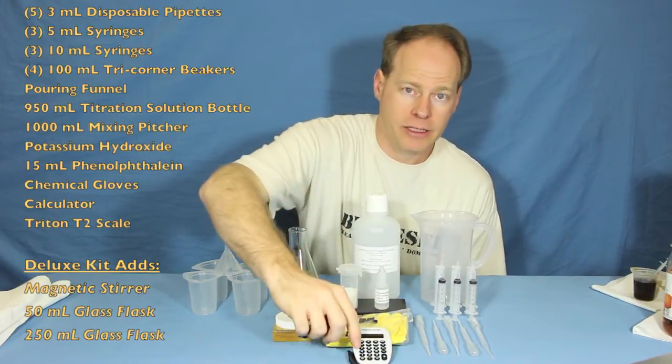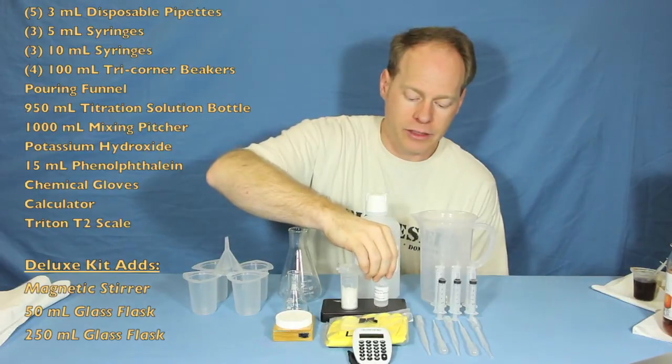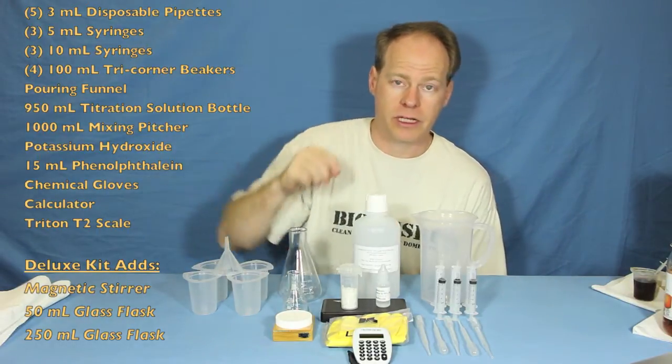We include a calculator so you can calculate out your titrations. We also include the phenolphthalein that you're going to need in order to titrate the batch.